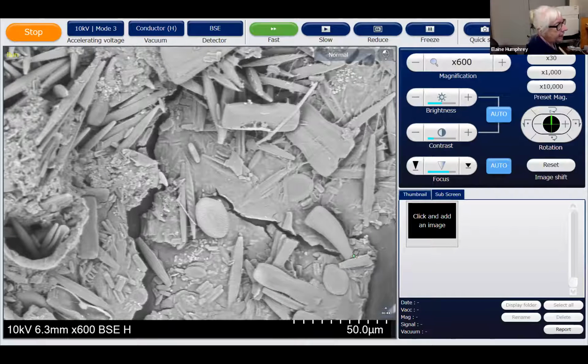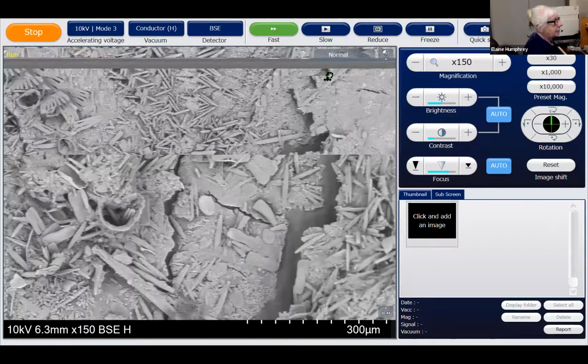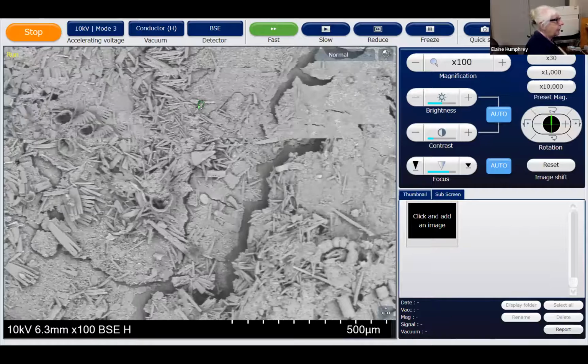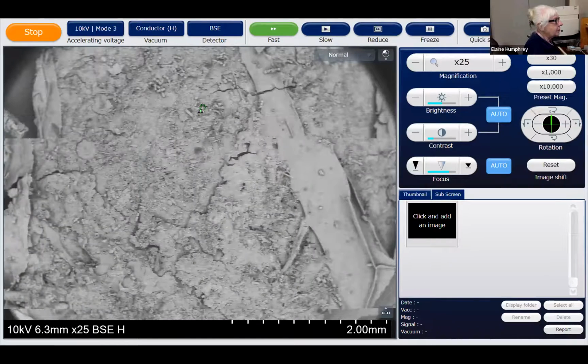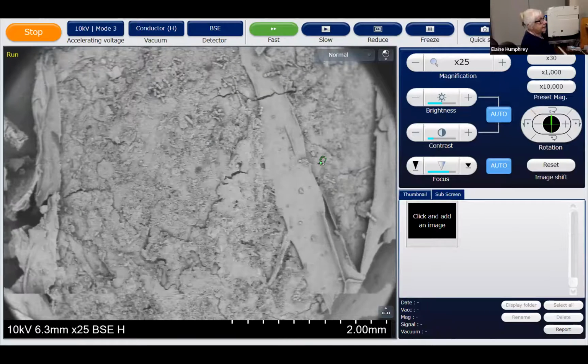Oh, and this one here is one of the triangular ones on a stalk. You can't see the stalk, and they grow as little colonies with stalks on the end. And so there's 5 species that we've got that look like this. There's another one, little fan-shaped ones, which are very cool. But I'm going to go and show you Bob. Bob's up here.